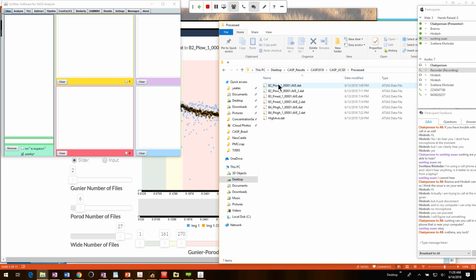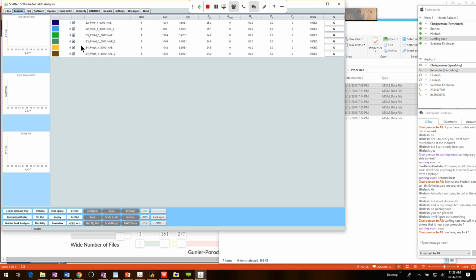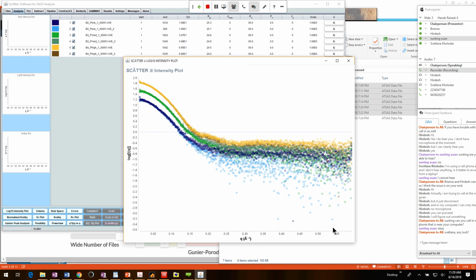So I've done this for the low concentration, the medium concentration, and the high concentration, buffer 1, buffer 2, for this whole sample set. You can drag and drop this whole thing in there and look at your essentially 6 scattering curves for that process. And again, you're looking for agreements in buffer 1 and buffer 2. So just making sure things worked out all right.